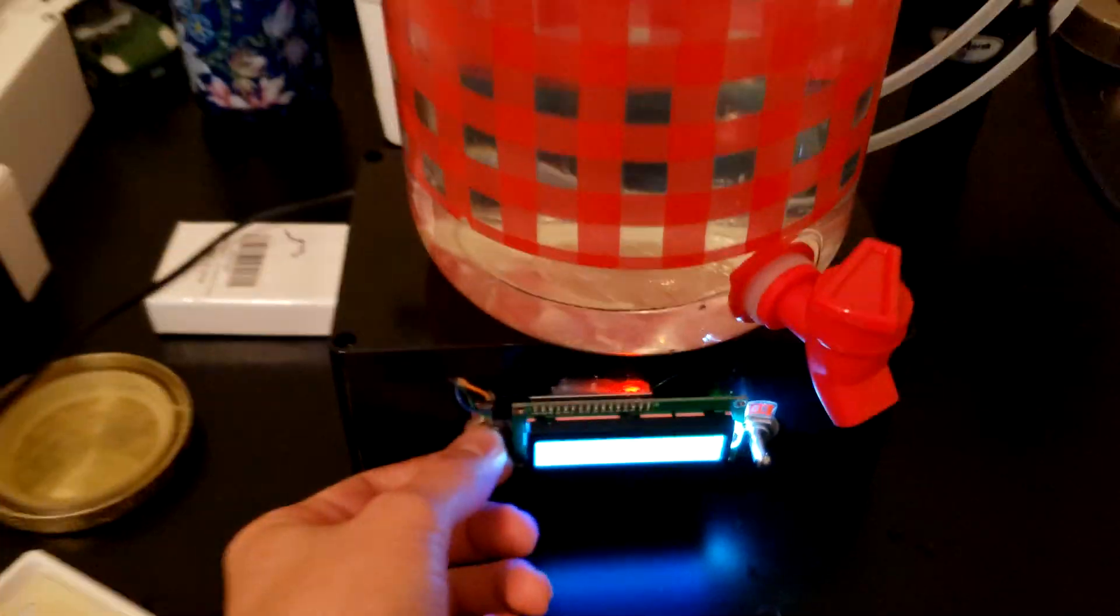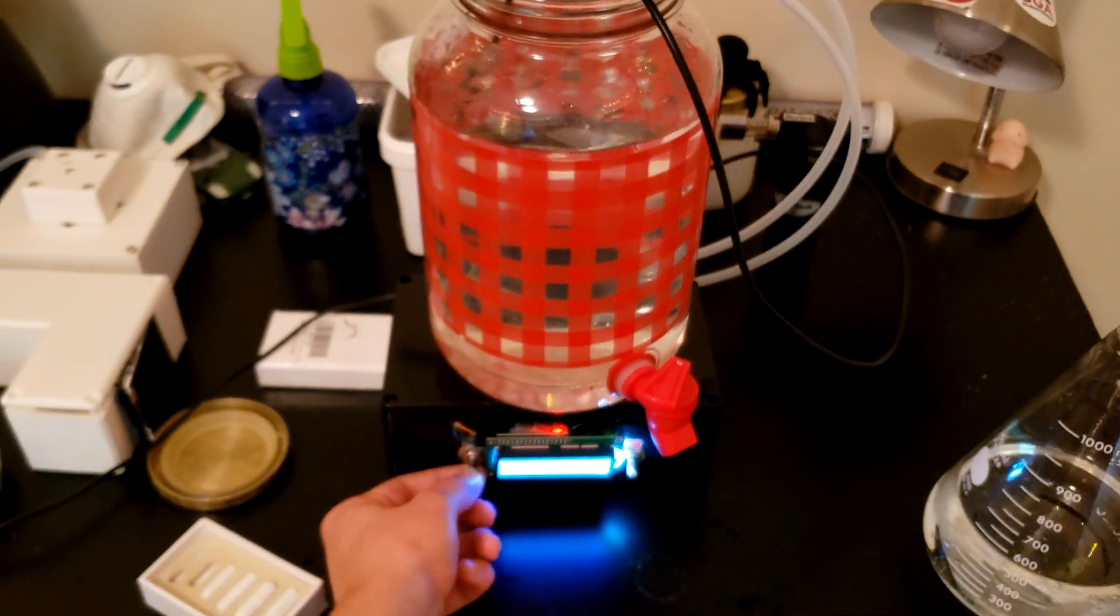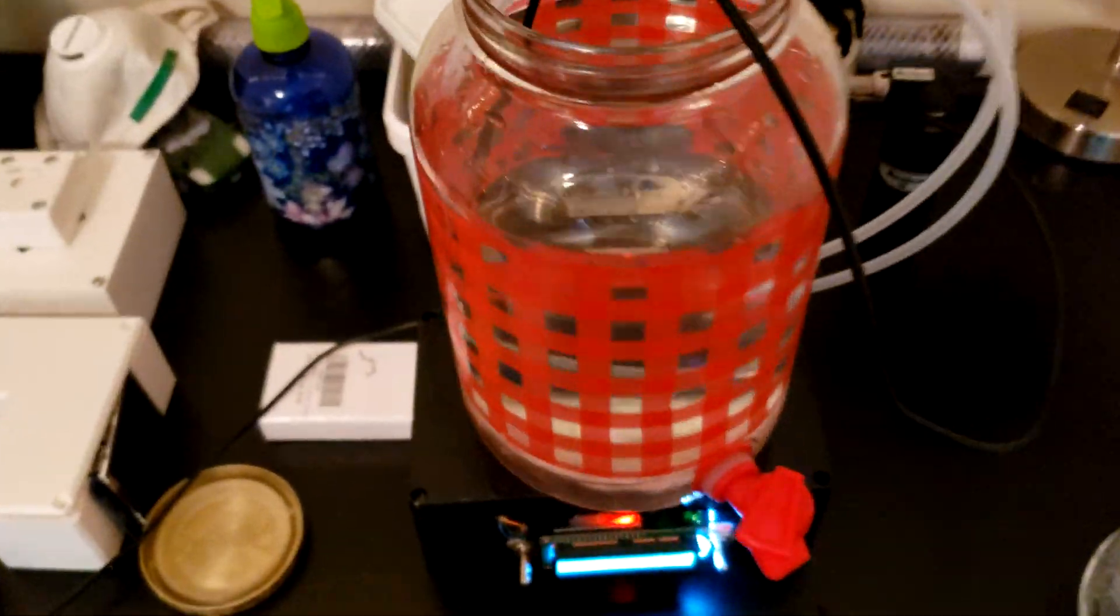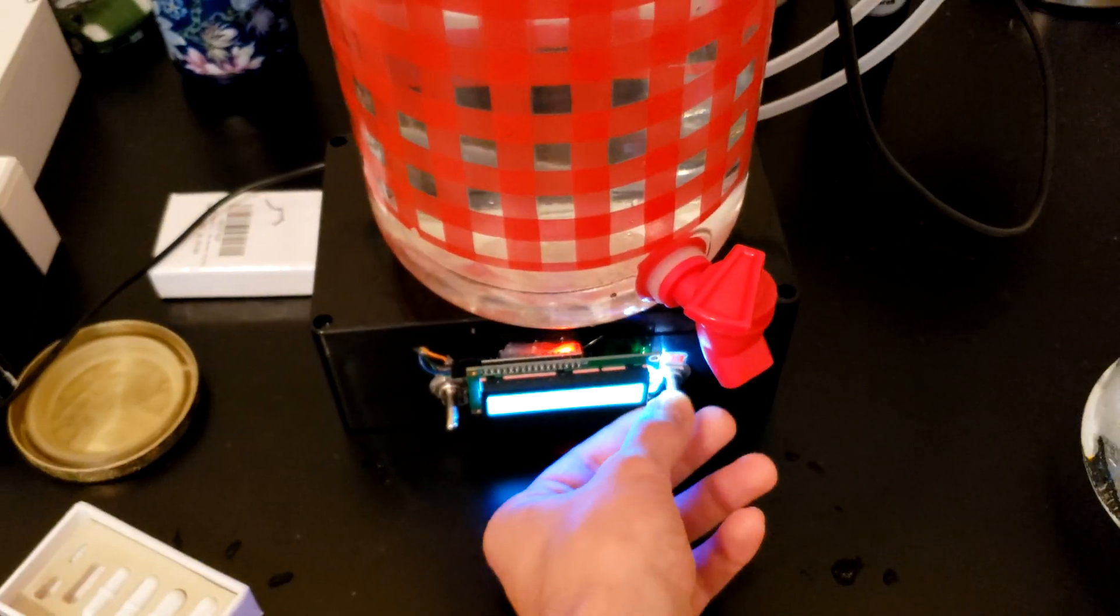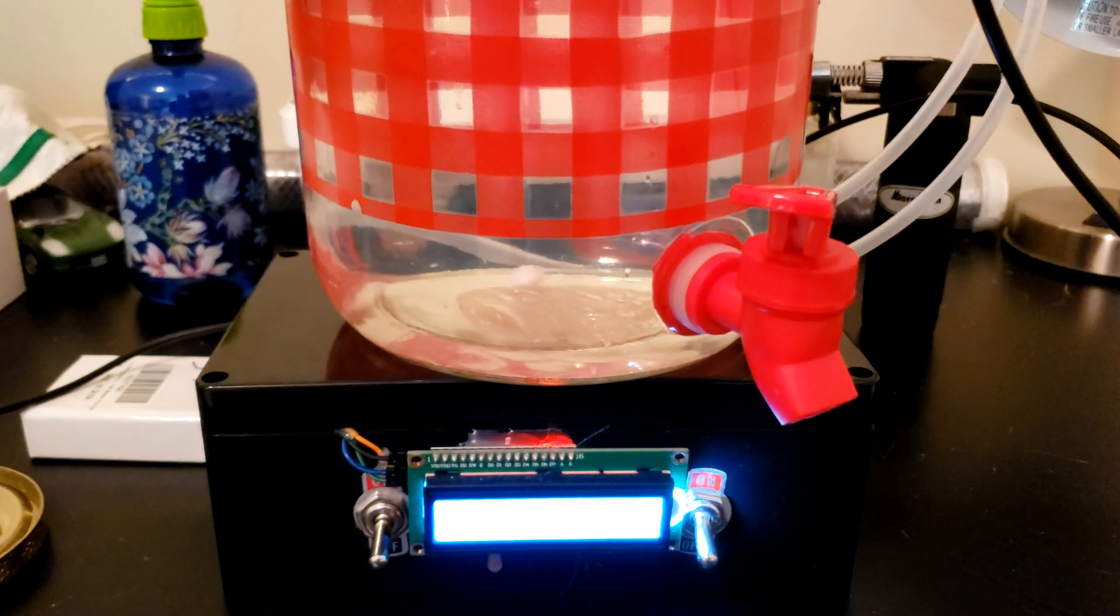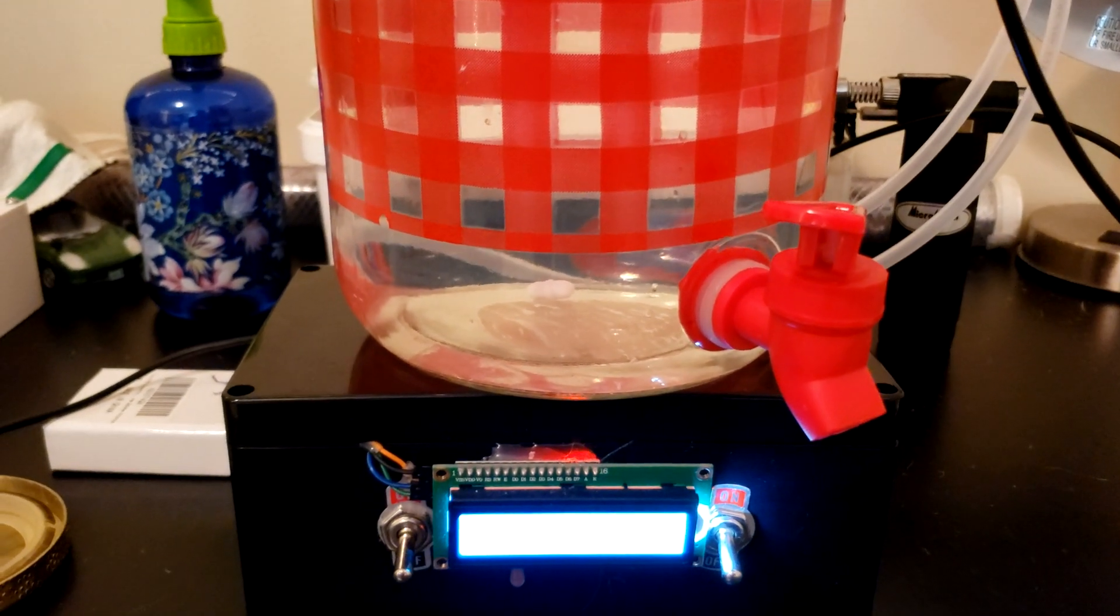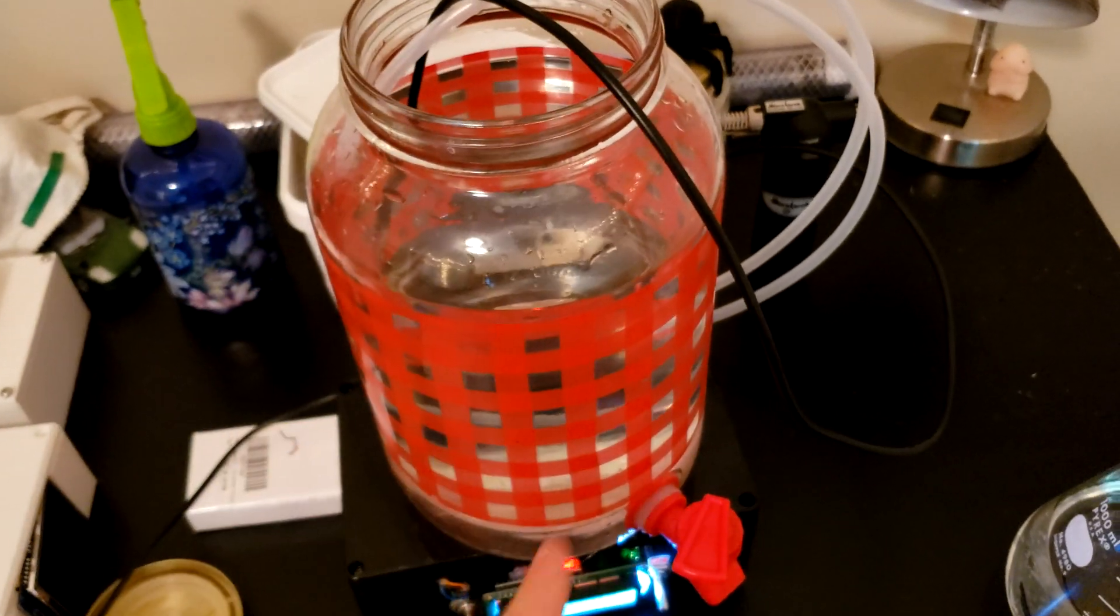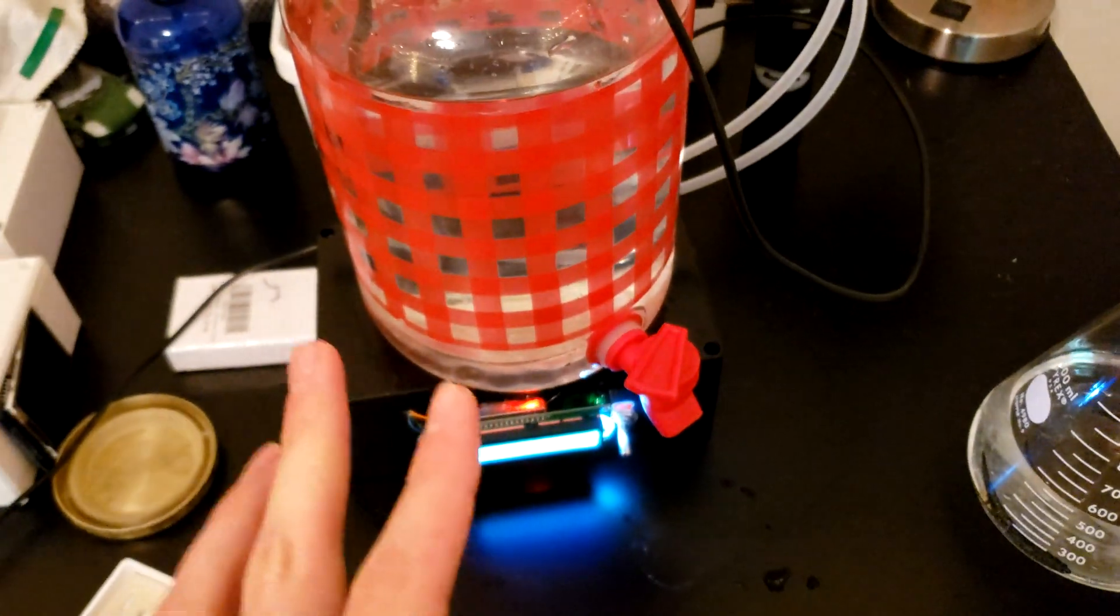So we got everything running. Let me turn it off because it's a little loud. So this is the air line. So you see the air bubbles stop there. But the little stir bar is still going strong and I can turn it off. And it slowly spins to a stop. That's everything working. The air is working. The stirring is working. The temperature is working. This is awesome.